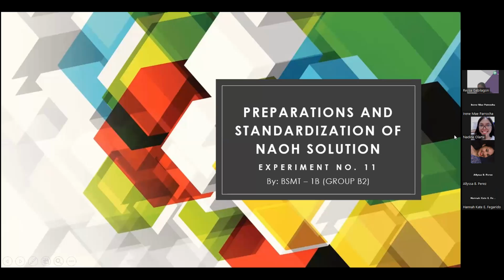Our reporting for today is preparation and standardization of NaOH solution. Next, please.